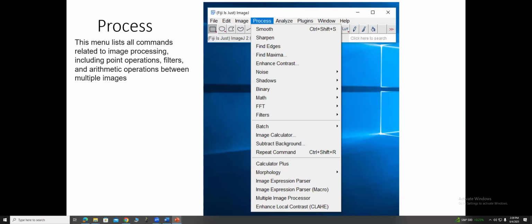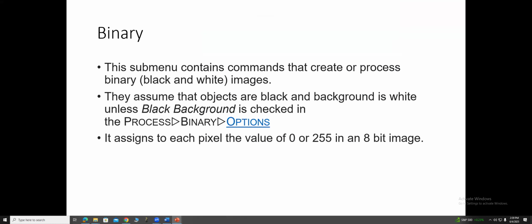Out of an image. Okay. And the way you want this is by making an image where you decide that above this threshold, I'm considering signal, and below this threshold, I'm considering it not signal. So you're making an image binary by making it yes and no, 0 or 255 in an 8-bit image, right?